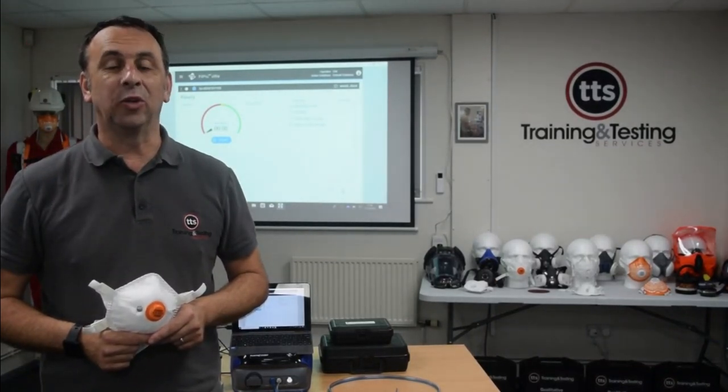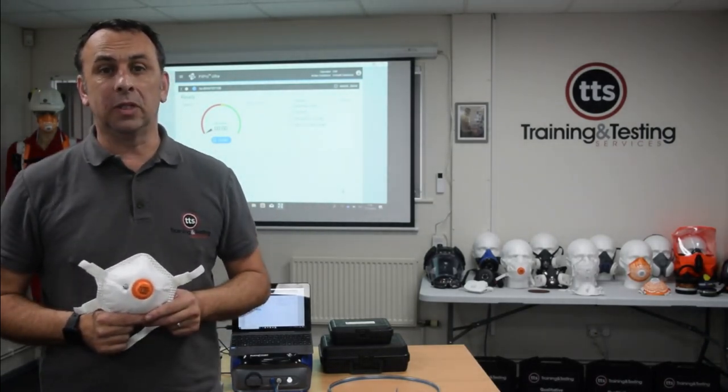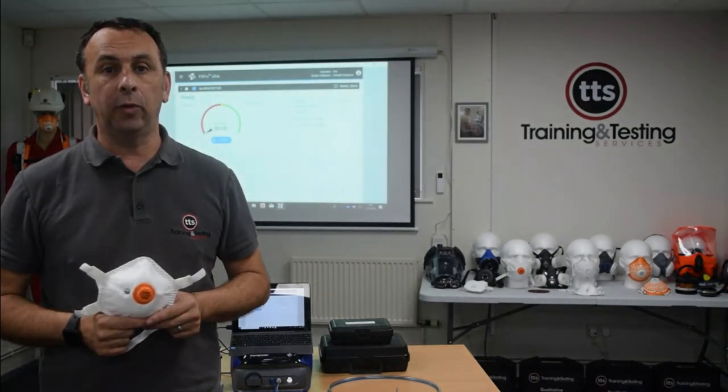Okay guys, as you can see, I've been away, I've had a shave, thank goodness for that. So what we're going to do now is repeat the same test, but this time with me with no facial hair. So again, we're going to start off with the Alpha Solway 3030V, we'll test that, we'll get the results, and then we'll look at it afterwards.